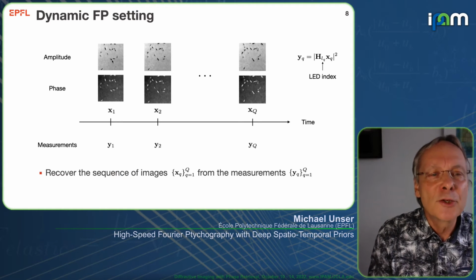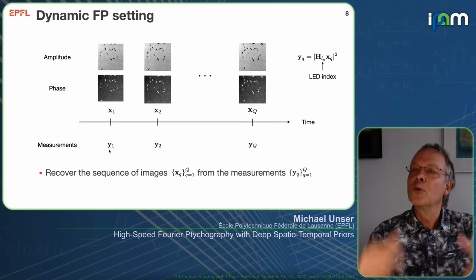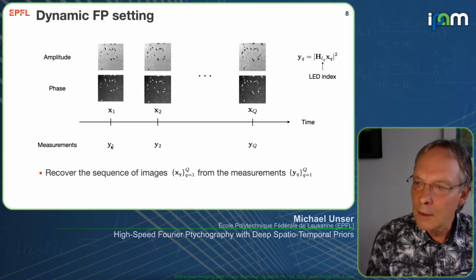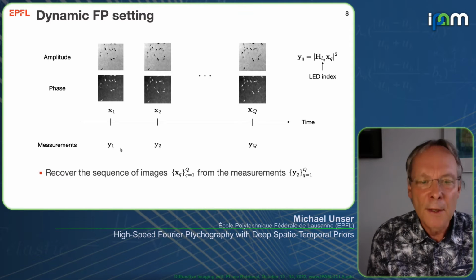And now for each of those complex images, we're just extracting one measurement, which is a modulation with a given plane wave, and you know all this, going through the Fourier, etc., giving us a low resolution image.